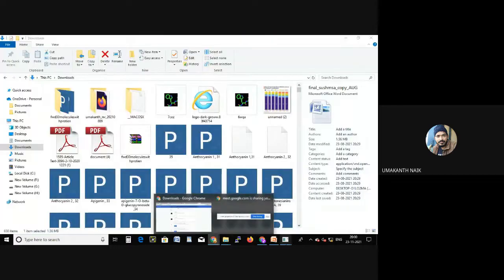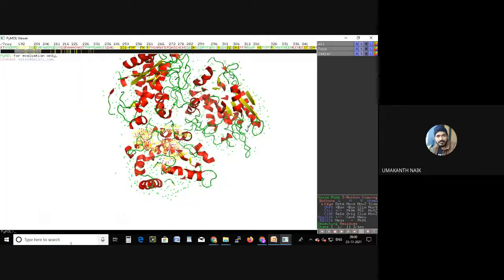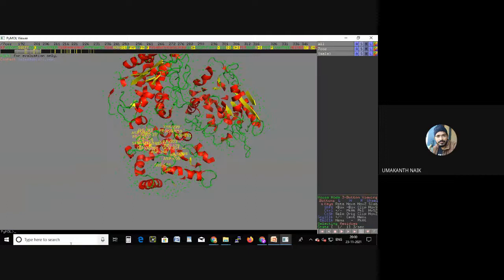So if you want to represent this picture, you can also give a code called bg. Can you see here, down at the arrow at the cursor I'm showing you? Select bg_color white, it will change. Whereas if you want yellow, select yellow. If you want gray, you can select that.